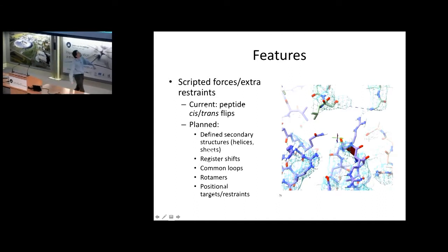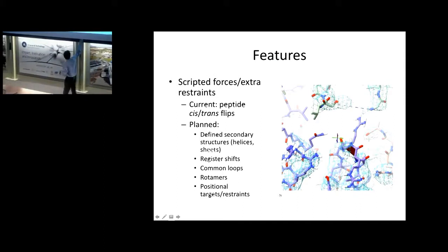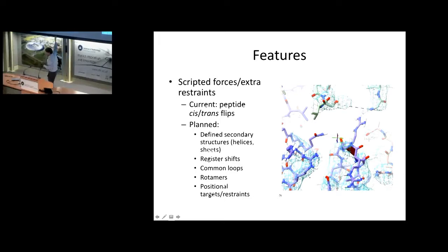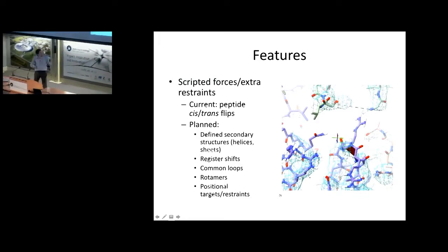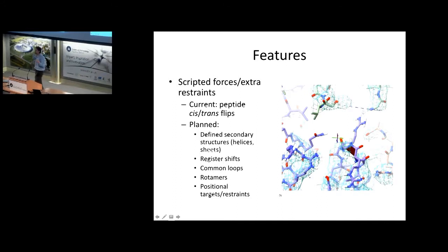But as a first example of the idea, here's an example of a cis-peptide bond that shouldn't be here, out on this loop, unsupported by absolutely anything. So you've got the visualization there, the now standard filled-in U-shape to show this is probably wrong.